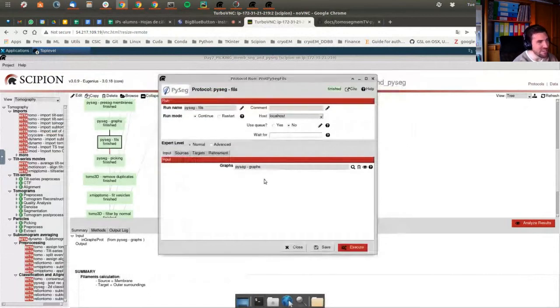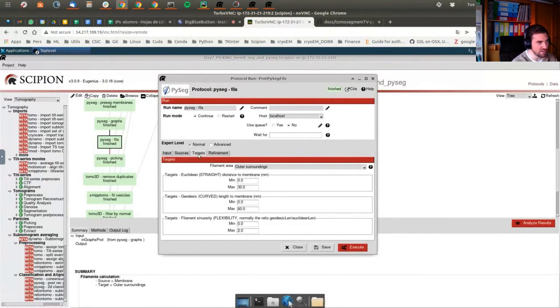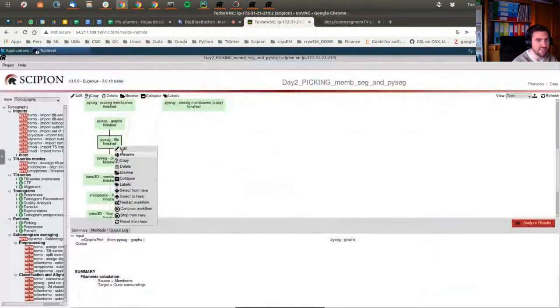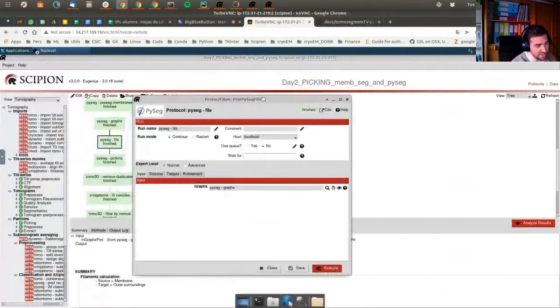Okay, meanwhile, let's check what parameters were used here. As you can observe, indeed, I don't know if this has the parameters. Yeah. Okay, you can filter them much more using higher values. Maybe I wasn't thinking of explaining it in so much detail, but regarding the graphs issue, I've done it.